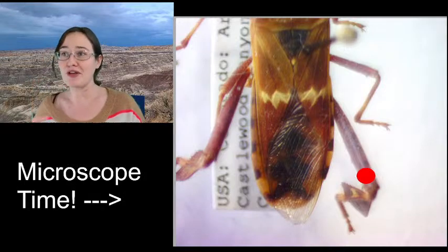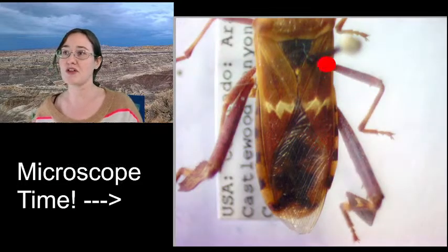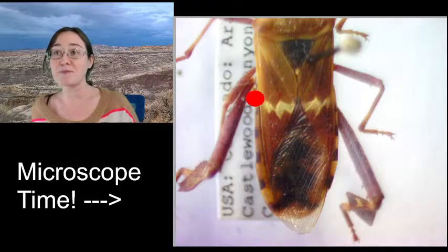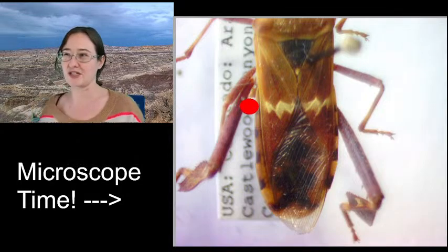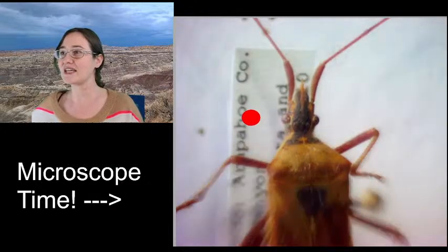So that's going to be one of the characteristics to identify this to family. And then if we're going further and further, getting it down to species, this line across the hemielytra helps out getting it a little further. But really, your key characteristic, other than like the color and the shape and those types of things, is this spine up here in the front of his head.